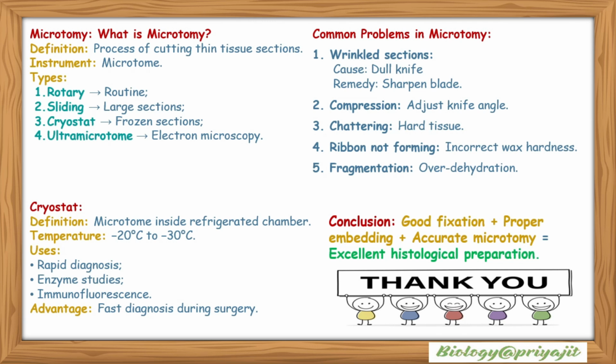So the conclusion: we can say that good fixation plus proper embedding plus accurate microtomy gives excellent histological preparation. That means better diagnosis, better research, and better microscopic interpretation.